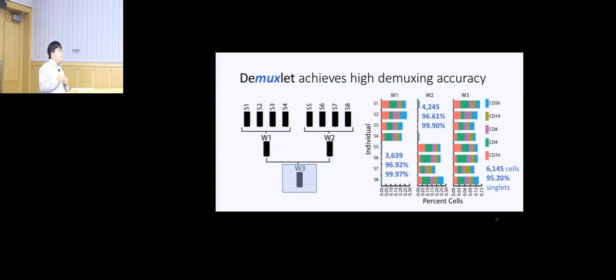You talked about cost. Just in terms of actual cost, how much would you save in an experiment like that? It really depends on the sequencing cost, because this doesn't necessarily reduce the per sample, per cell sequencing cost if you want to go deeper for each cell. In terms of library prep, it's really just 1 divided by the number of folds you're going to overload, because you're going to use the same number of hydrogel beads to load, and you're just increasing the cell flow rate.